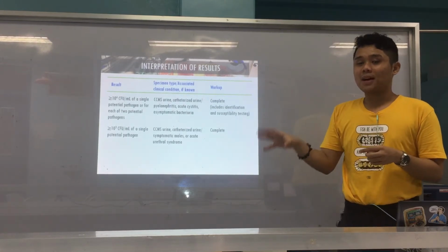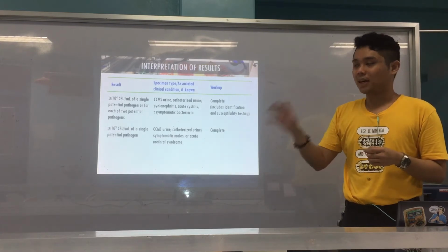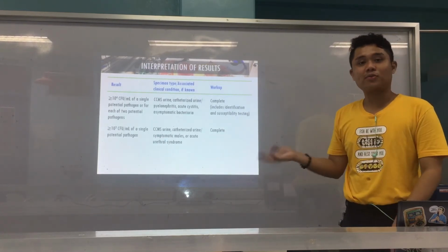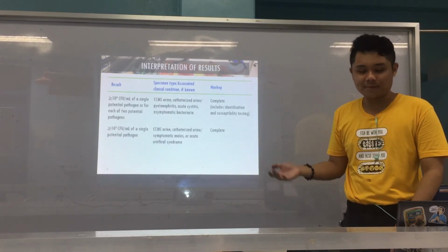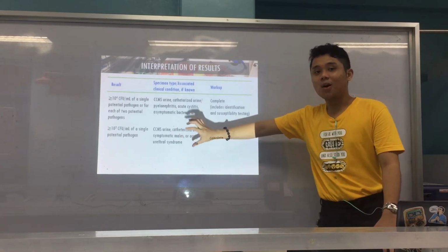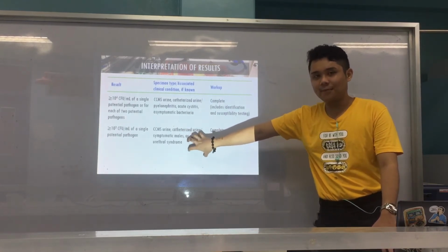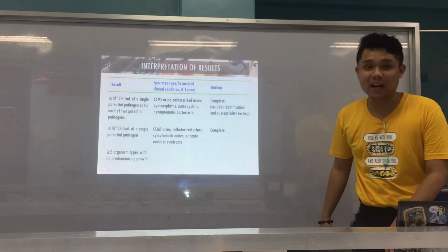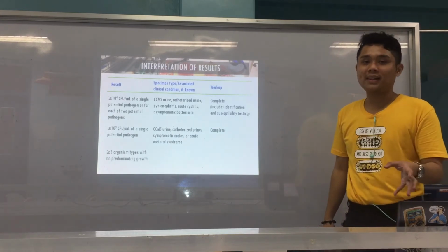And again, it is one pathogen or one bacterium that you isolated. So therefore, that could mean that it is the cause of the UTI. Alright? So if that is your result from these specimens or conditions, your workup should be complete.